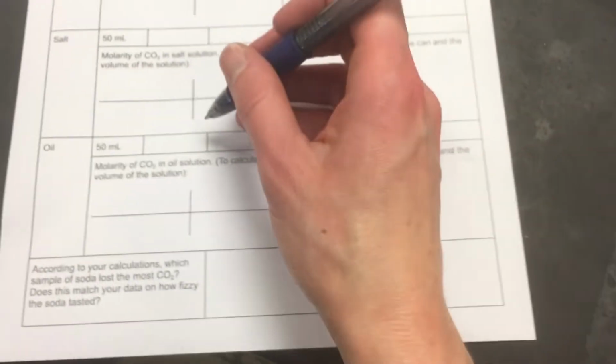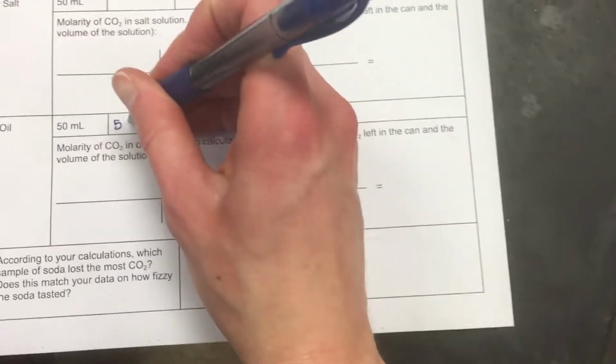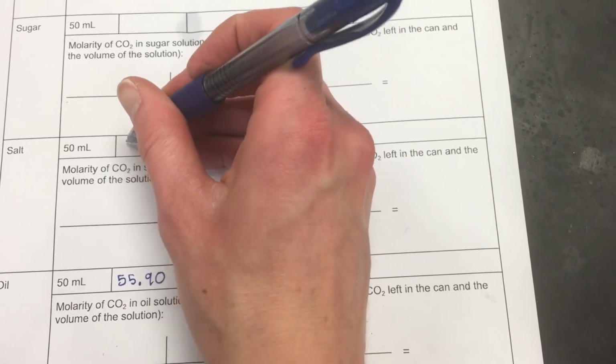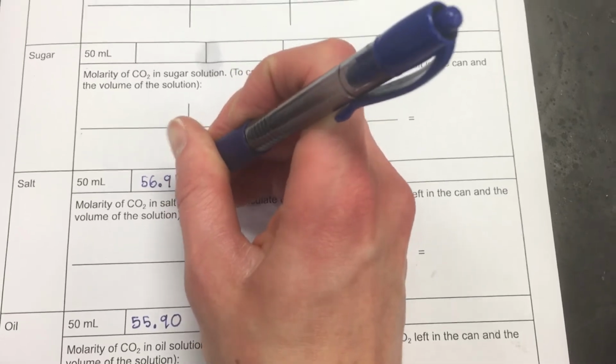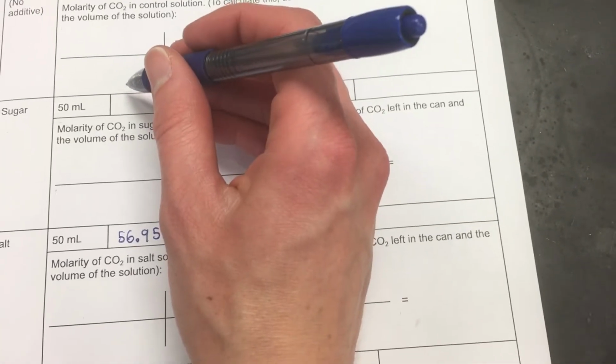Okay, so you should have those down on your paper. It's going to look something like this. We said the oil was 55.90. This one is 56.95. And I don't remember what this one was. Whatever that one was, the sugar, write that down.